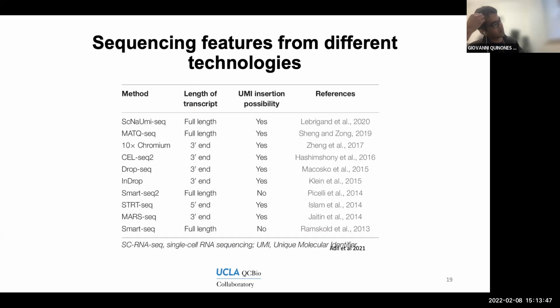Right, that's a very good point. If we have access to the full length of the transcript, we can tell something about the RNA molecule. Like you said, we can tell, for example, if it was degraded. You can easily think of the case where you expect the gene to be very long, but you only find reads mapping to a specific part. Then something happened to that other part. It was probably degraded. So that's a very good point. Are there any other ideas?